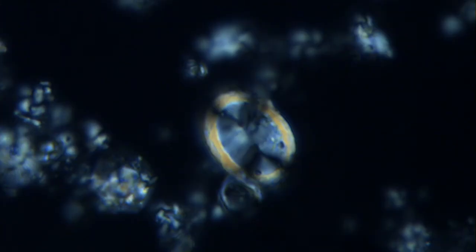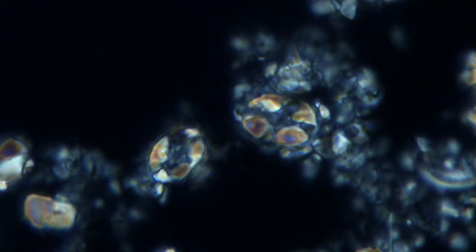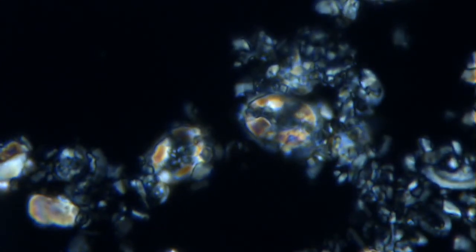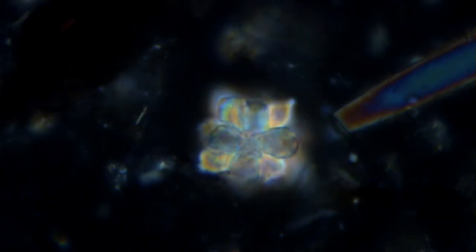So, these retardation colors indicate thicker elements of the calcareous nanofossil, like in these examples of Pontosphaera, or the occurrence of recrystallization, like in these Cretaceous specimens. This is also very important to register because recrystallization can hamper calcareous nanofossils identification. As we mentioned, retardation colors change very fast in calcite or aragonite crystals because of its high absolute birefringence, and that's why we can see several of these colors mixed together in specimens.